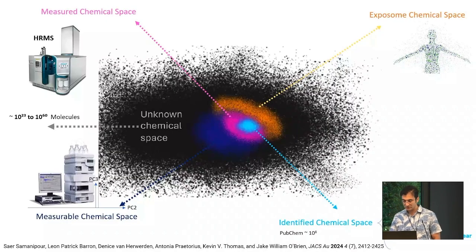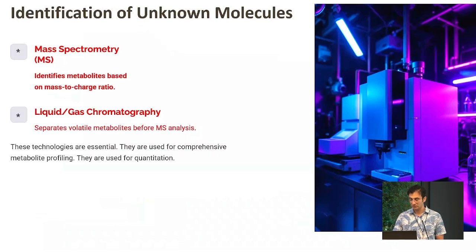So the idea is using machine learning methods in order to improve the identification of unknown molecules for different purposes in metabolomics and in omics studies specifically, because we want to find the biomarkers for the diseases, follow the pathway of the diseases, and even cure the diseases by using these molecules in drug discovery projects. So we need identification more and more.